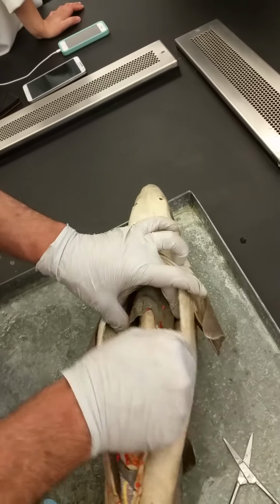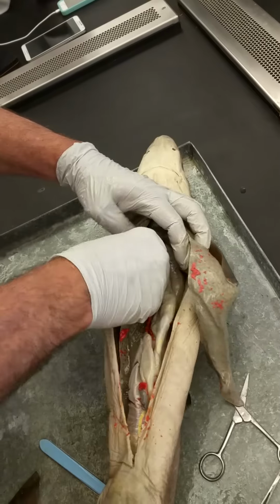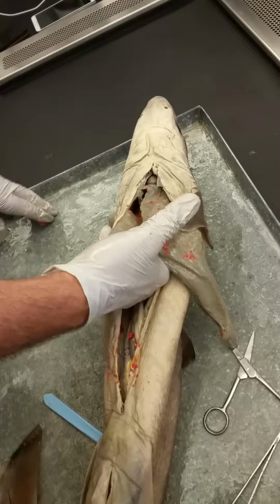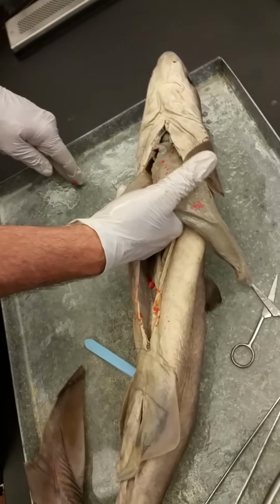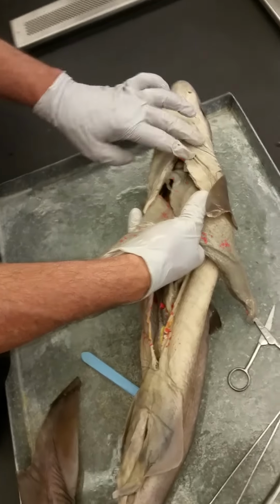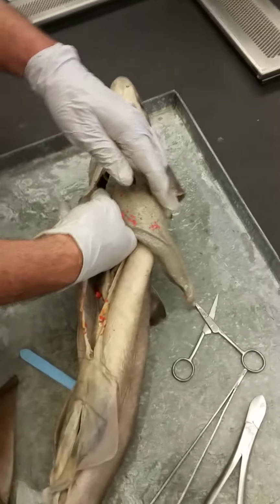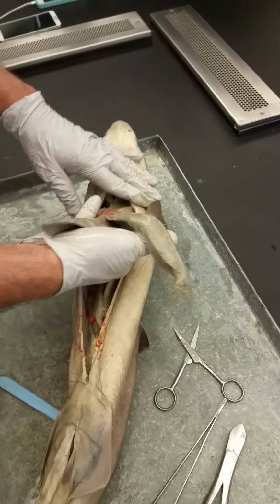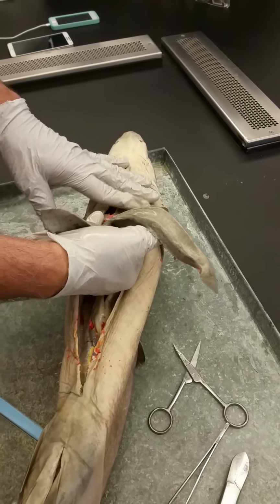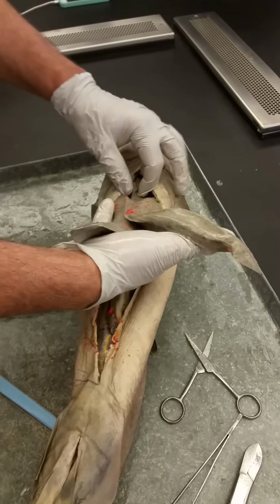Then we come to the liver. The liver on sharks is huge. 25% of its weight can be its liver. The liver is huge for a whole bunch of reasons. Remember, the liver is kind of your biochemical factory, so it's doing a lot of jobs. It's also used as a storage organ for energy, so it stores a lot of oil for the long term, so they can go a long time between meals. They live off that oil in their liver. There are 3 lobes to it here.